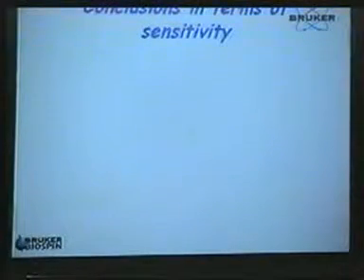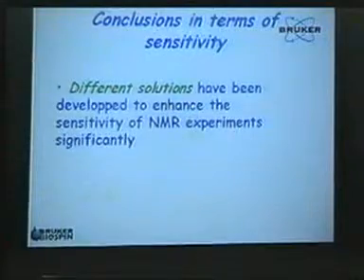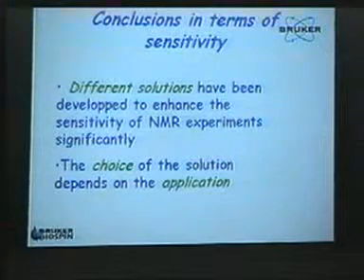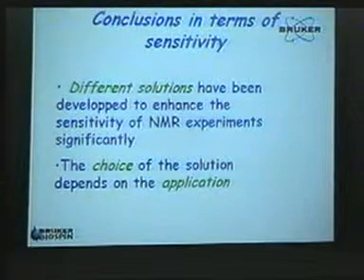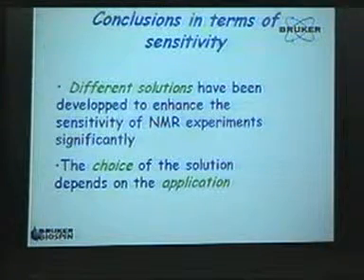Okay, so in terms of sensitivity, after these explanations and all those spectra, what did I show? I showed that different solutions have been developed to enhance the sensitivity of NMR experiments significantly. And I've also showed that the choice of the solution will depend on the application.